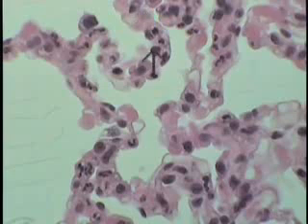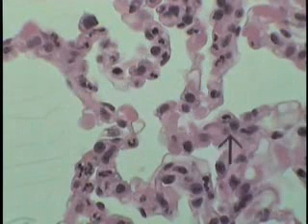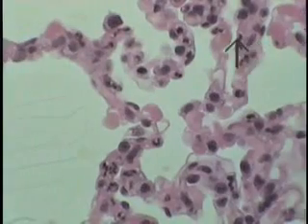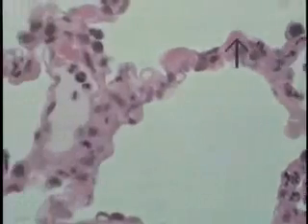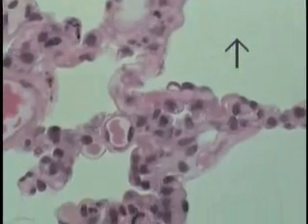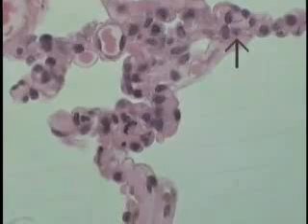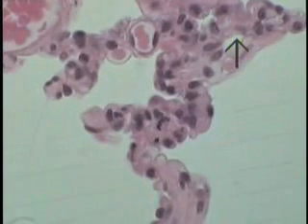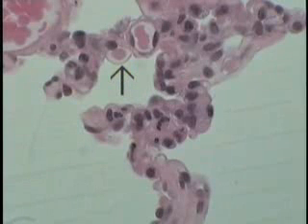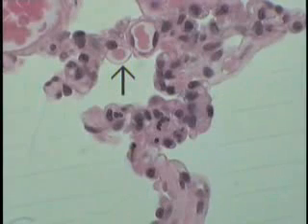So this is a series of alveolar walls that have, due to the lack of pressure when this tissue was excised, was cut out, this rather confusing appearance. But several of the detailed features can be made out when you examine this particular tissue at increased magnification. Again, that blood-air barrier is demonstrated quite well at the tip of the arrow.